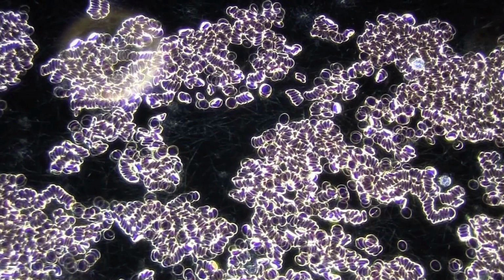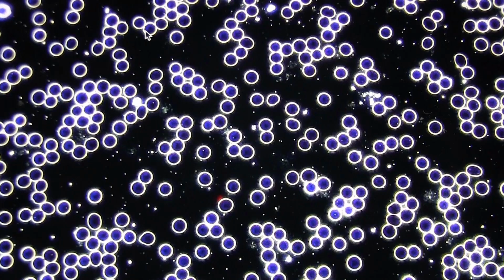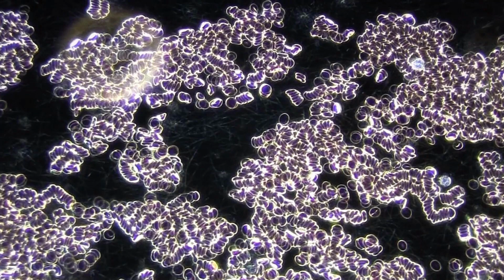What we have here is a lot of red blood cells stacked together in a formation called rouleau, where there's very poor circulation, very poor oxygen CO2 exchange. The red blood cells should be visible and separate like this one right here. Instead, they're stacked up, and there are multiple causes of that, including dehydration, poor digestion of protein, excess carbohydrates in the blood, sugars too high in the blood, and overall a low negative charge in the blood, where the zeta potential in the cells has been diminished, so cells just clump.